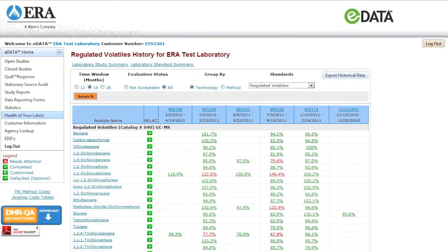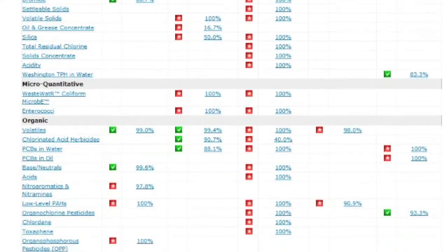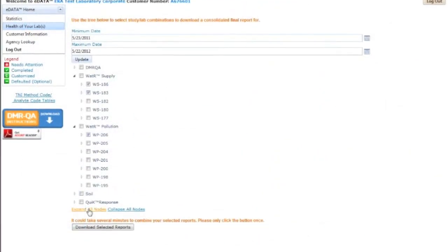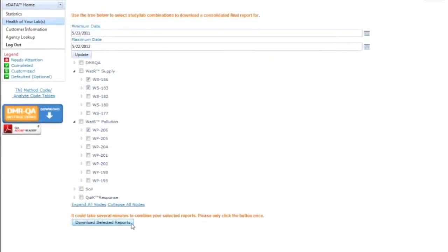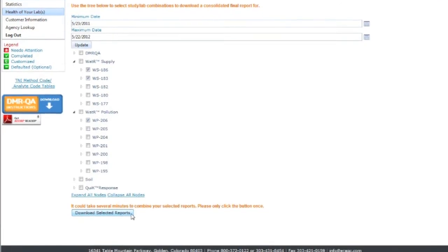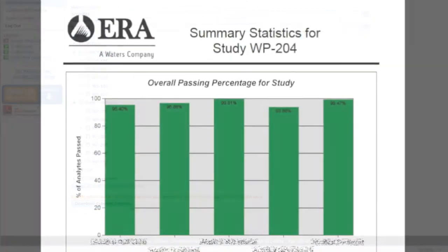Health of Your Lab not only makes your data actionable, it does it in real time. As soon as study reports are released, you can view the results on Health of Your Lab.